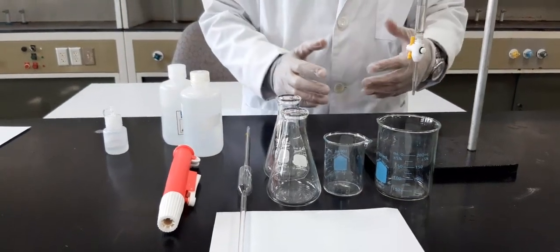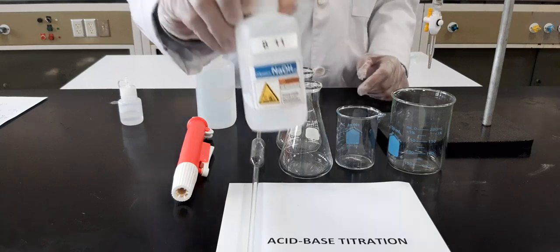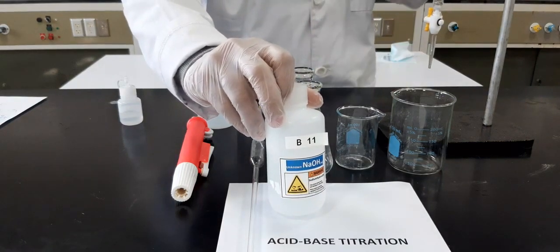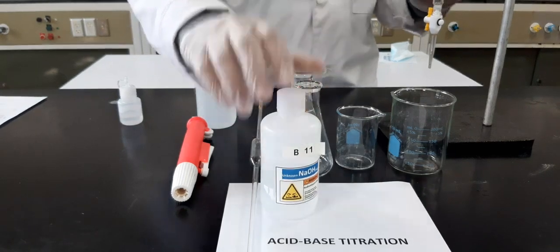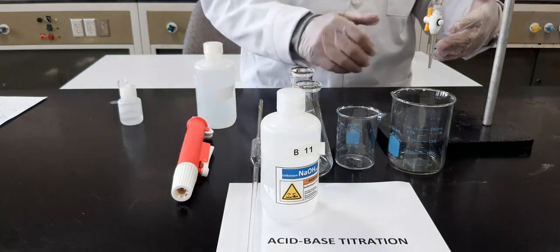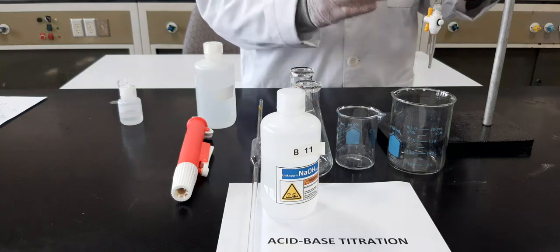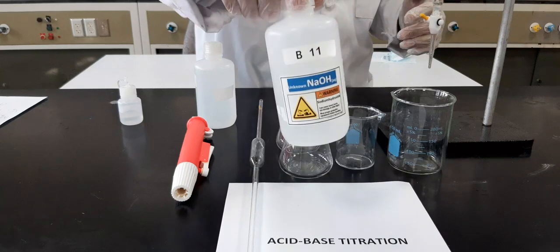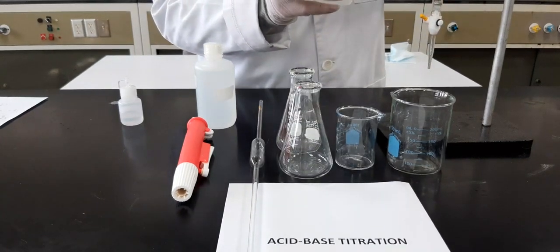In this process, we should know carefully that the base solution, which is the unknown one, we should take in the burette. But we know that somebody else used the burette for other purposes. So we have to wash it out first, clean or rinse it before starting our experiment. So we have to take this base solution into the burette.